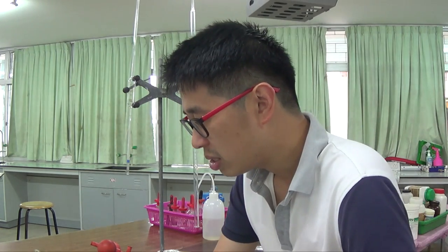Let's get started with chemistry. So, calorimetry. This is a reaction between NaOH and H2SO4.